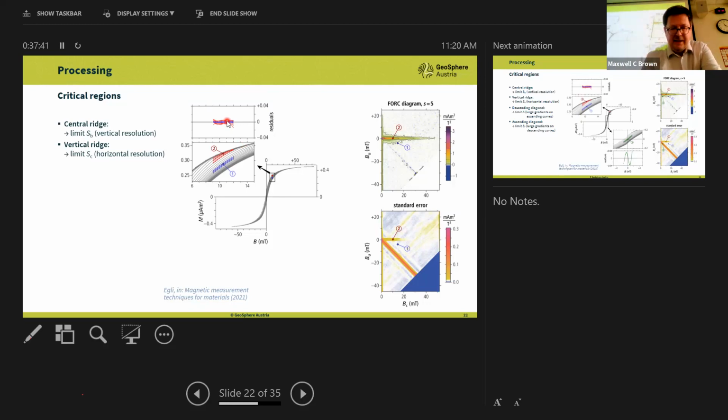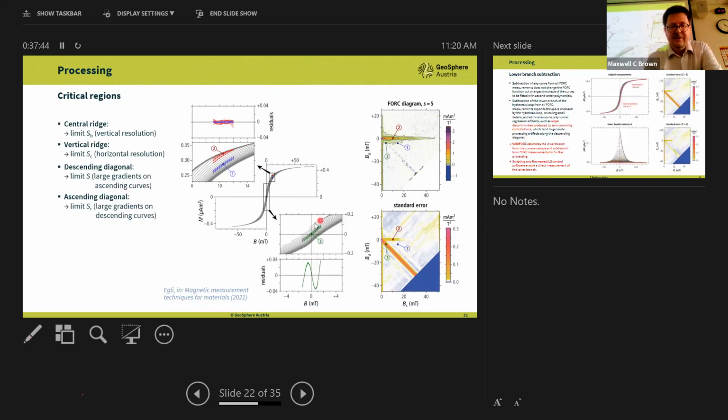Then in this particular case, there is also the region around zero field. Okay. This looks almost normal to the naked eye, but if you zoom in, you will see that actually when crossing 0, these curves change their slope abruptly. And this is again a manifestation of viscosity and something else, which I will speak about on Wednesday. In any case, the first derivative is discontinuous. You have very large residuals, you see here, and so you have problems with the representation.